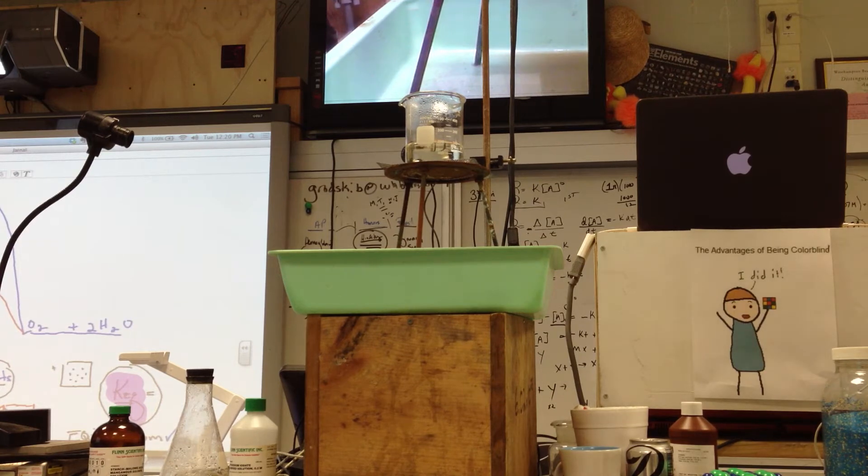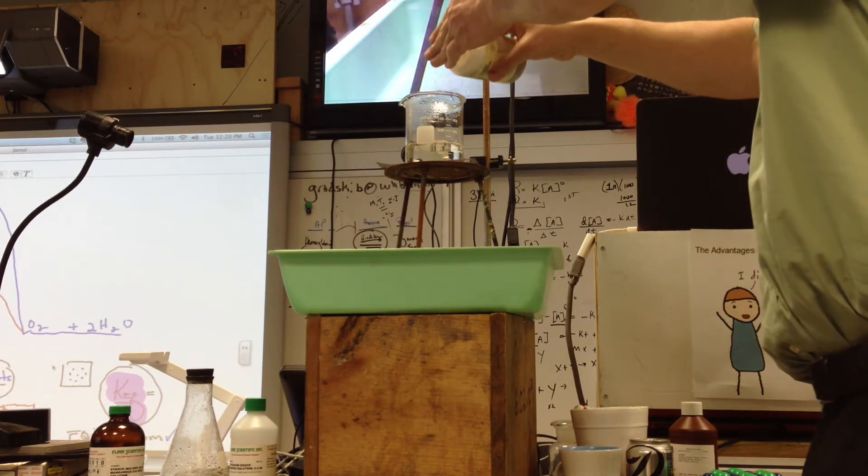So what I'm going to do is I'm going to add a catalyst. Now, this catalyst, not iodine, is a little purtier. This is cobalt chloride, and this is a nice little purdy color.